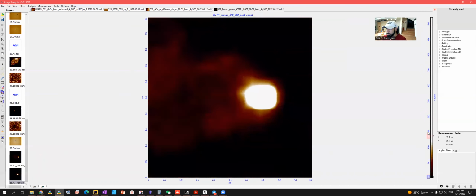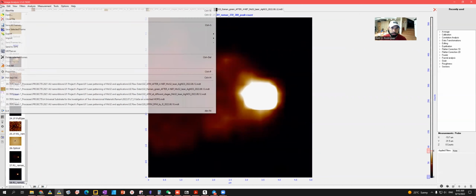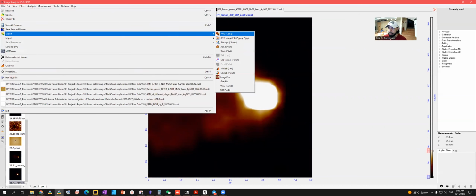Okay, so what do we do now? Once you have this mode and you export it, that's as much as this thing can do. There are different ways you can use PNG and play in Affinity Designer. That's one way we could do. Yes, let's do it that way.